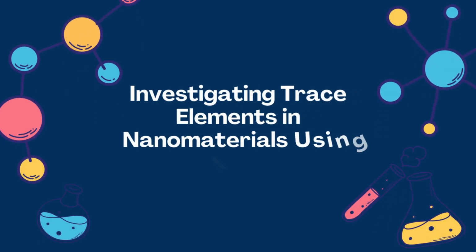Hello everyone. Today we will be exploring the fascinating topic of investigating trace elements in nanomaterials using ICP-MS.